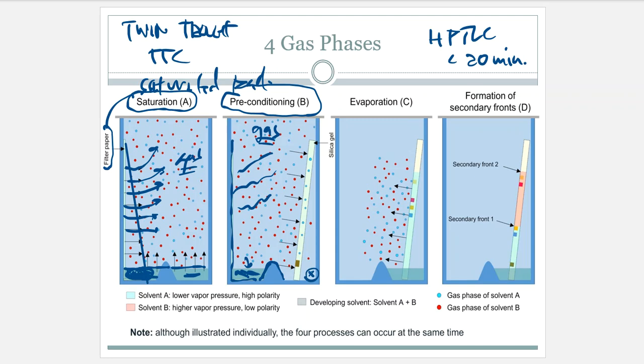All right, so normally what would happen in this case is that there is no developing solvent in the front trough. Notice how this is made. There's no liquid there at all. I've got my plate, my silica plate, that has been lowered inside of the tank at some point in time. And that plate is not sitting in developing solvent. So nothing is moving through the silica. Therefore, there is no mobile phase at this point. No separation is taking place at all.